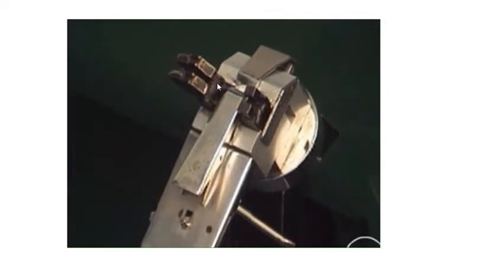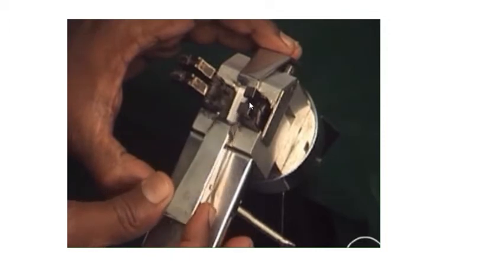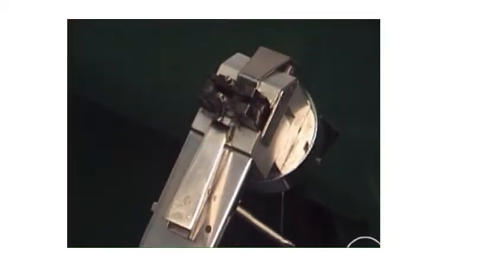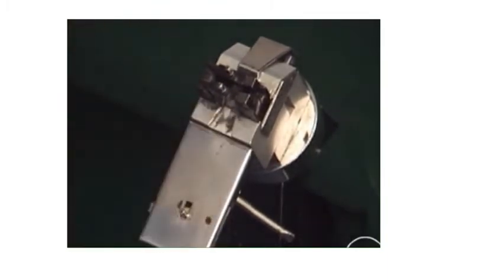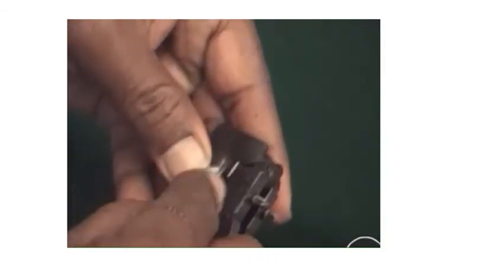These fibers are placed in these clamps and the clamps are locked and tightened using the vise. And the tweezer is removed and the bunch is taken, and using the knife the extra edges of the fiber are cut so that there is a 15 mm length.